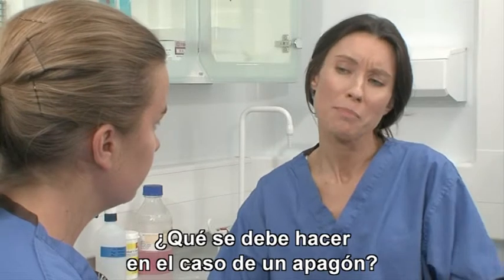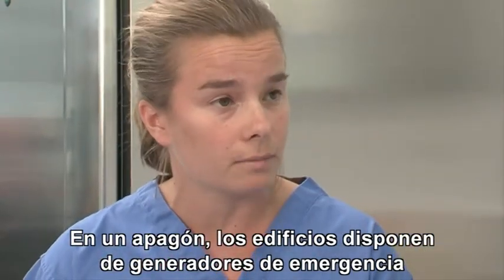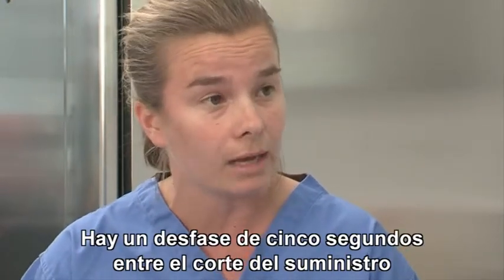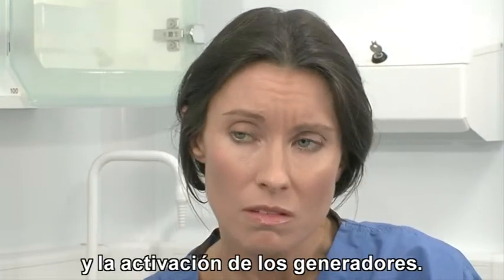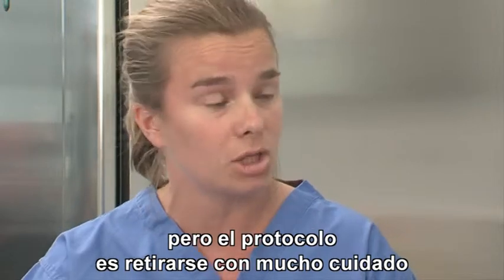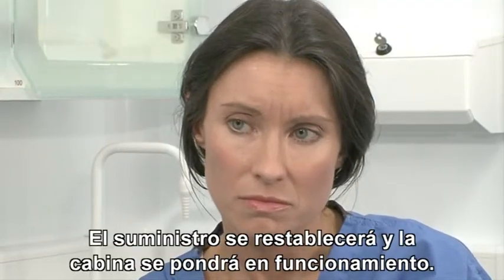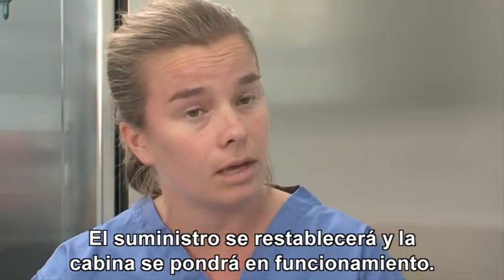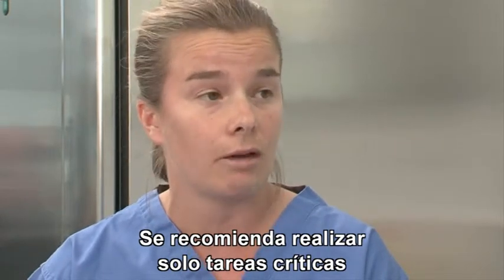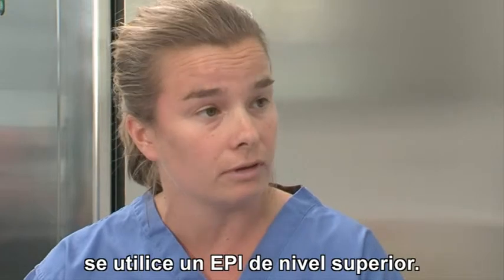What should you do in a power cut? In a power cut, all of our buildings are on backup generators, so if the power goes off, the generators will kick in. There's about a 5-second lag between the power going off and the generators kicking in. If you're working in a cabinet, then the airflow will decrease, but the protocol is to very gently remove yourself from the working area, removing your PPE. The power will kick in again and the cabinet will start working. The recommendation is that only critical work is carried out when you're on backup generators and in those circumstances that you wear an increased level of PPE.